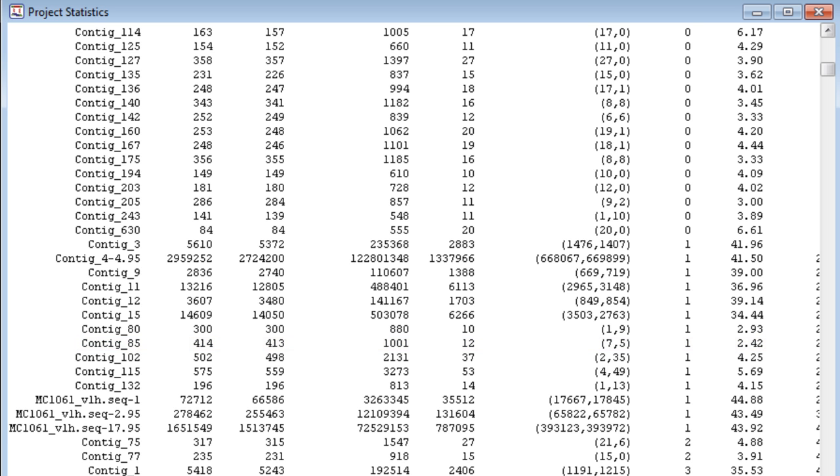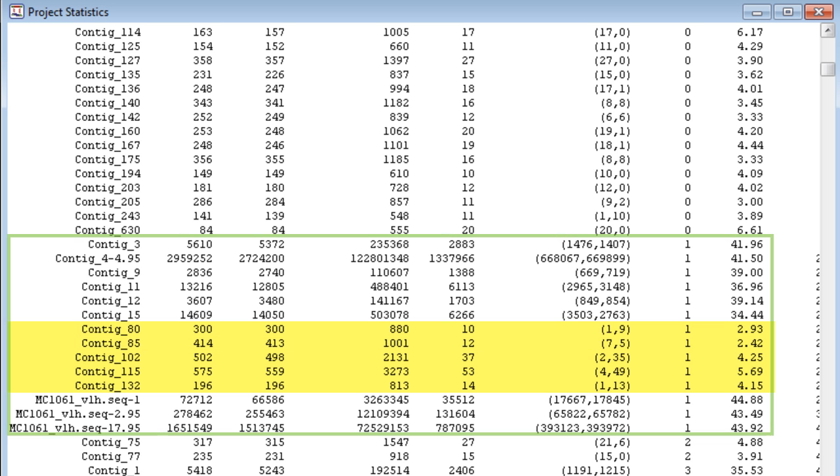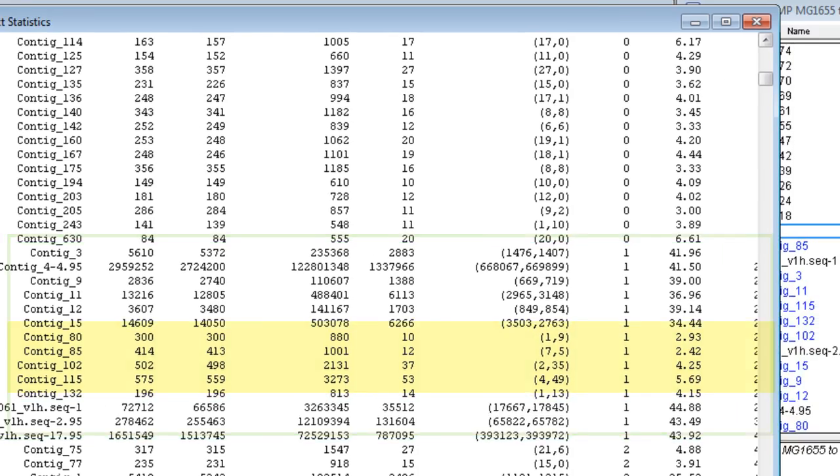In this particular scaffold, there is a pretty clear differentiation of low-coverage contigs, so I will move all contigs with an average coverage score of less than 6.